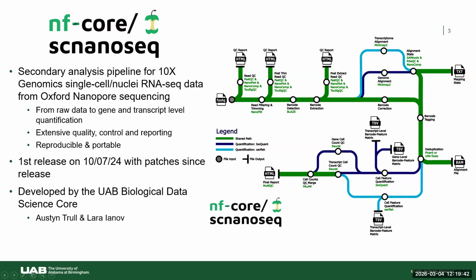And then at the end, we perform one last quality control step. It is done with Seurat, but it doesn't go into depth. The only goal of this particular step is to provide you with some key metrics that we believe are very important to secondary analysis. Going back to Cell Ranger, for those of you who've ever run that pipeline, if you open a report, you will see some very important metrics right at the top.